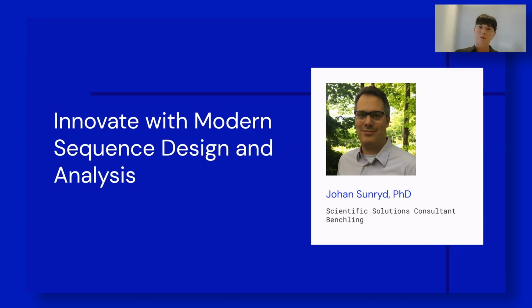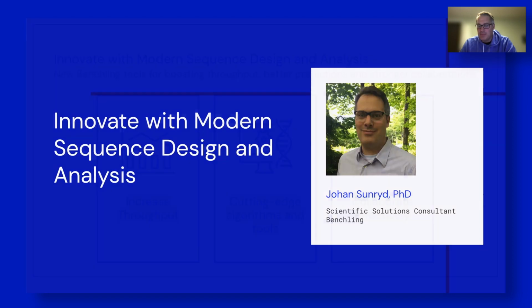Take it away, Johan. Thank you, Shauna. I'm happy to share some of the latest improvements we made to molecular biology and the registry. You've already heard about the new RNA capabilities from Zach, and I'd like to walk you through some of the new sequence design offerings that help to improve throughput as you scale your work and teams. I'll also touch on AlphaFold Beta for making predictions of 3D structures of your proteins.